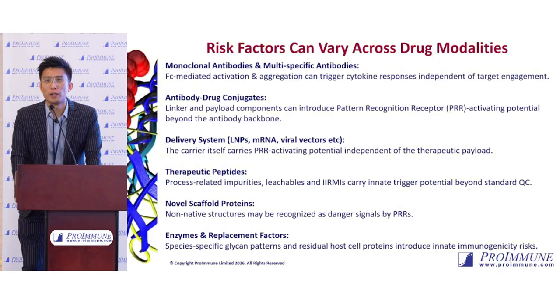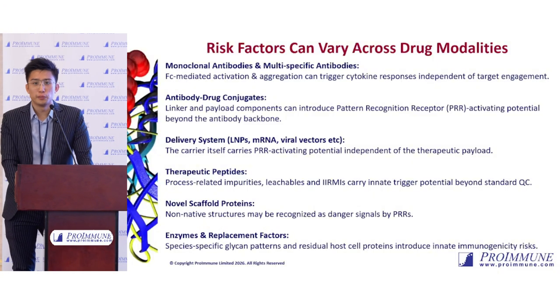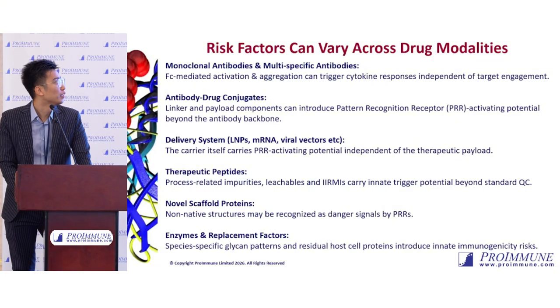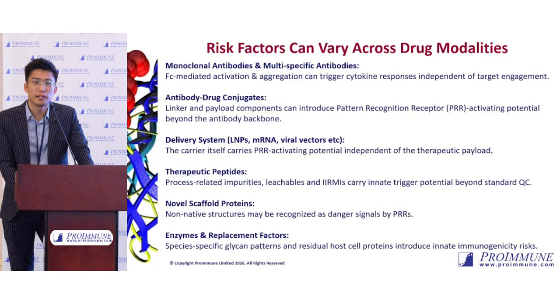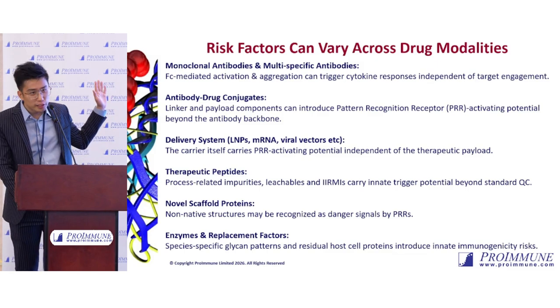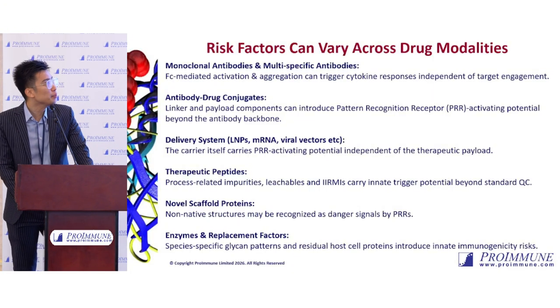So that's just one part of the drug modality. In that case, it was just a monoclonal antibody. But as we know, there are a bunch of different drug modalities out there. So what risk can they possess that we need to be concerned about with innate immunogenicity? These are some examples of a range of different drug modalities where such innate immune triggers can exist. For antibodies, it can be Fc-mediated activation or aggregation that can trigger cytokine responses, independent of the target engagement itself.